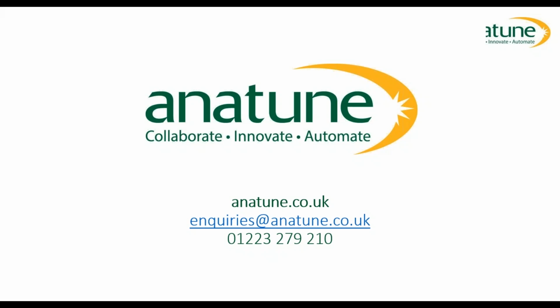And what you really need to do is find an internal standard that behaves like your analyte, but is a significant number of Daltons away in mass from your analytes of choice. So maybe perfluorinated compounds as opposed to deuterated compounds might be an approach here. It's definitely worth looking at, but it's not as straightforward as you might imagine at first look, I would say.